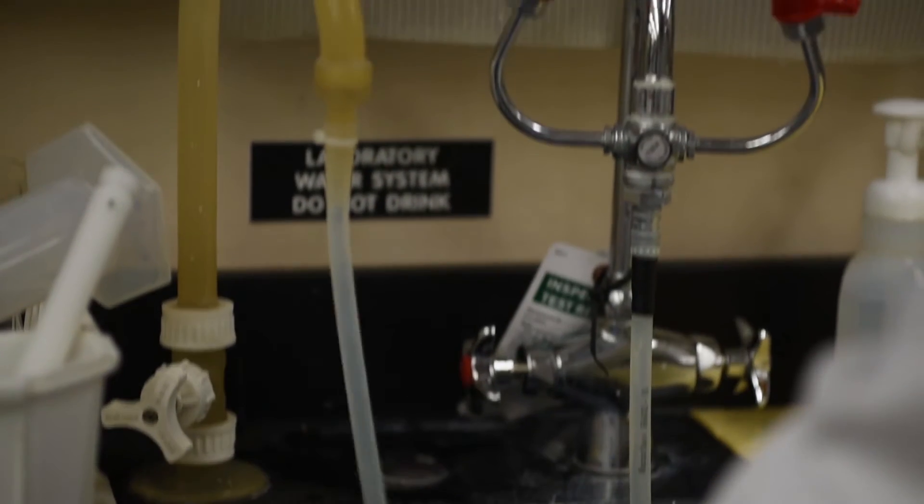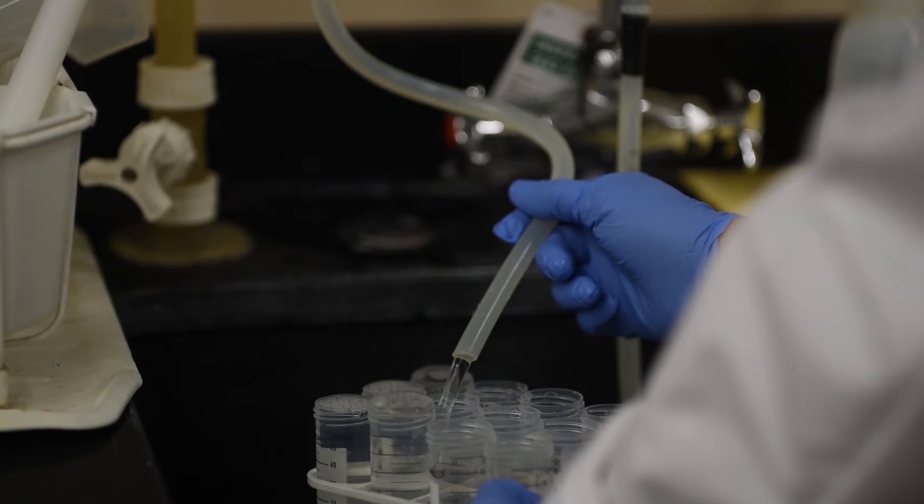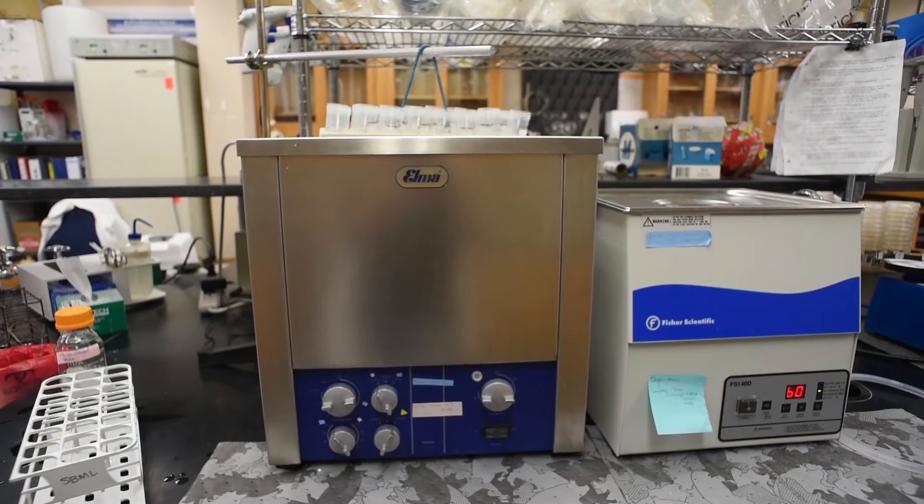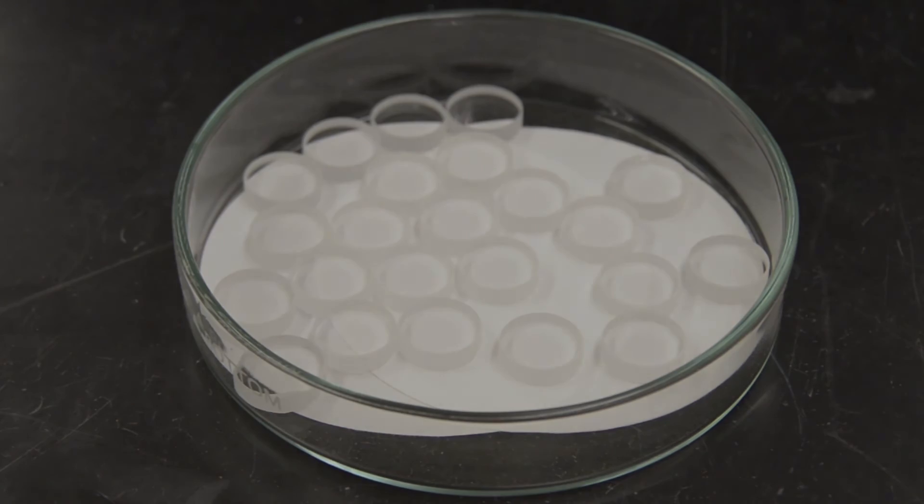Rinse the coupons thoroughly with reagent grade water until no detergent bubbles remain and sonicate again for 5 minutes. Pour the water from the vials. Spread the coupons out on absorbent paper and air dry.